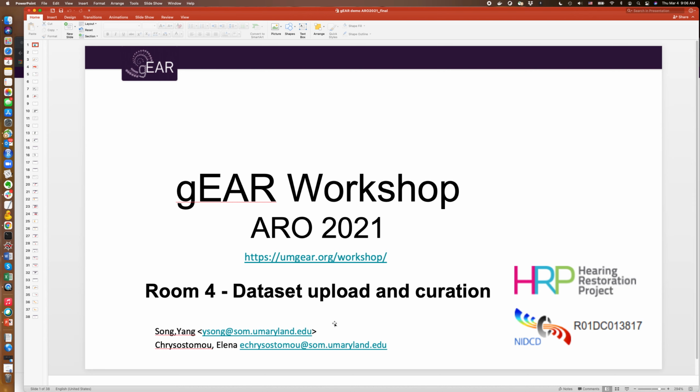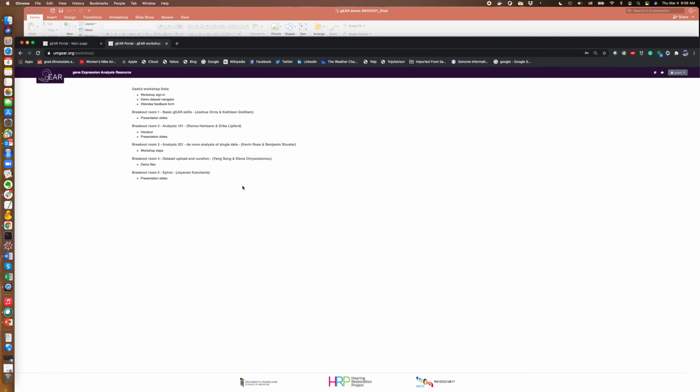Before we start, please go to the website umgear.org/workshop to download the demo files that we are going to use for today's practice. When you log into that page, you're going to see multiple downloading links. We are in break room 4, dataset uploading and curation. There are multiple demo files that I prepared for today's purpose.